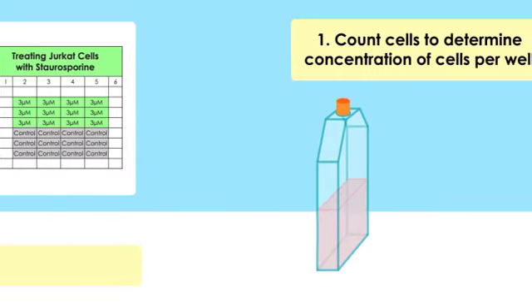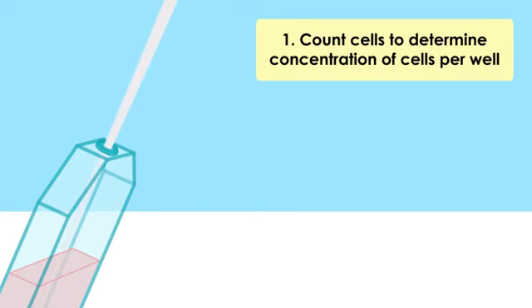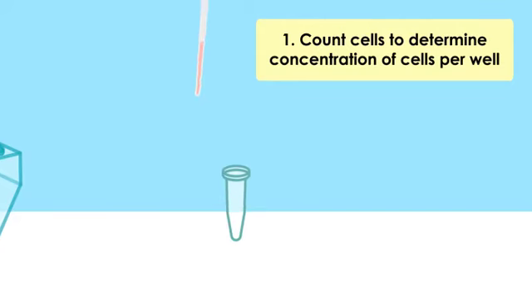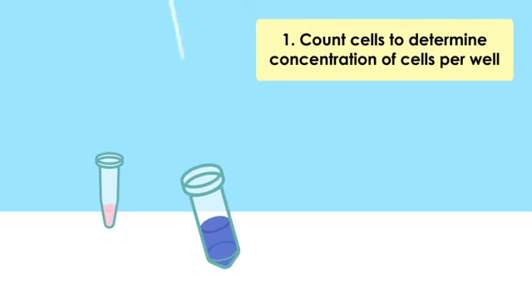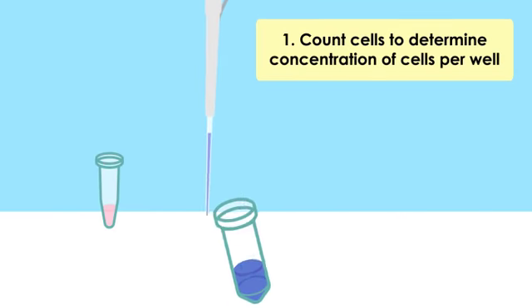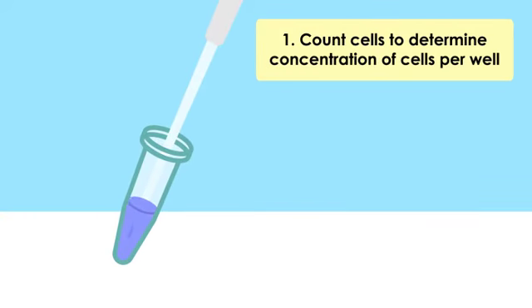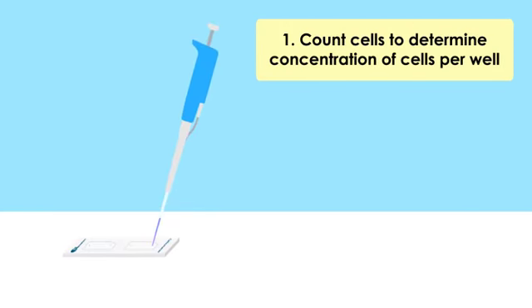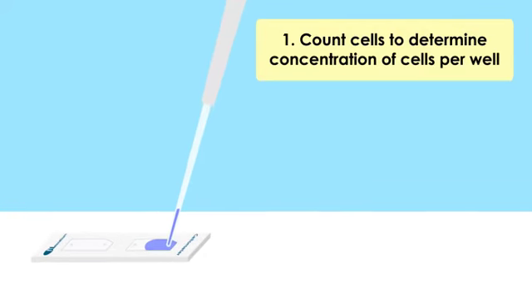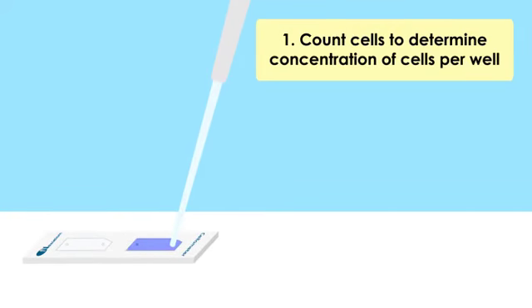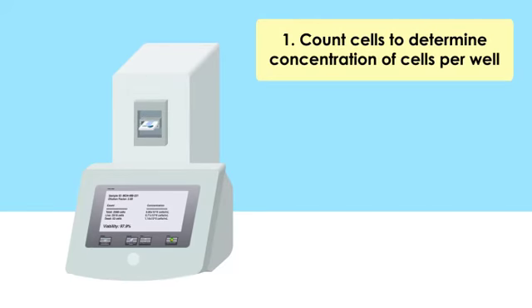To achieve best accuracy of your cell plating, first measure the cell concentration by using a Salometer automated cell counter. Mix 20 microliters of cell sample and 20 microliters of Trypan Blue. Load 20 microliters of stained sample into the Salometer chamber slide and perform a cell count to acquire cell number, concentration, and viability of your sample.